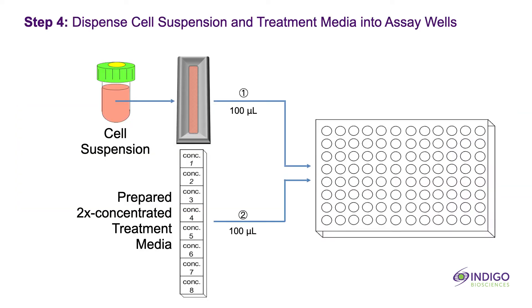You are now ready to set up the assay plate. First, retrieve the tube of reporter cell suspension from the water bath and sanitize the outside surface of the tube using a 70% alcohol swab. In the biosafety hood, gently invert the tube of reporter cells several times to ensure a homogeneous cell suspension. Note that if you are intending to perform antagonist mode assays, first supplement the cell suspension with the reference agonist. We recommend using a concentration that is equal to 2 times the EC80 concentration of the agonist. Pour the cell suspension into a reservoir, and using an 8-channel pipette, dispense 100 microliters per well of the cell suspension into the assay plate. It is important to prevent cells from settling in the reservoir during the dispensing period. Next, dispense into the appropriate assay wells 100 microliters of the previously prepared 2x concentrated treatment media.